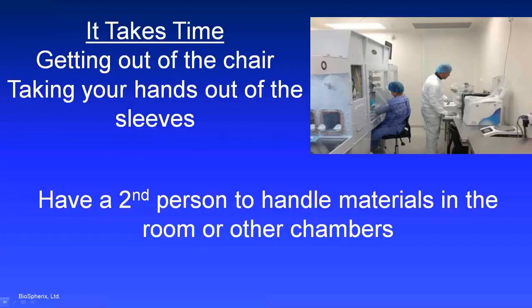Oh, but let me go back and say, notice this person's kind of hunched up at the Xvivo processing chamber. If they set their chair just a few inches lower, they might be able to sit a little straighter and get their body closer to that glove front for more comfort.